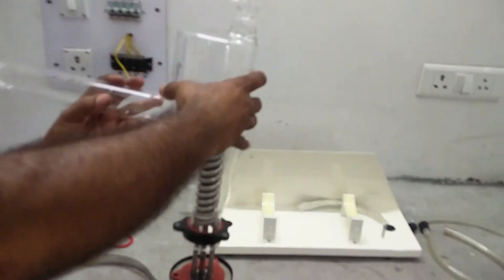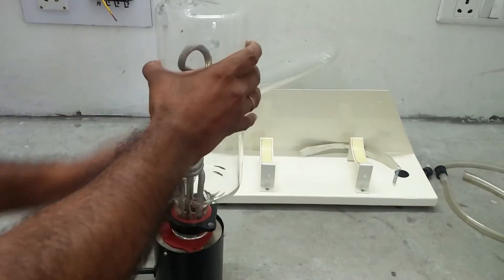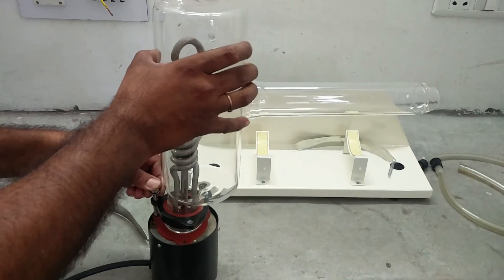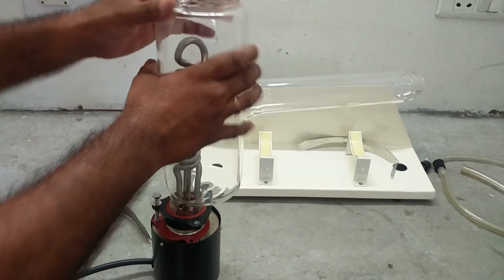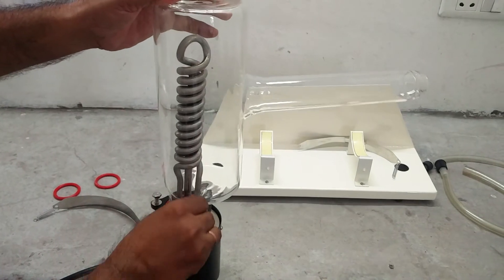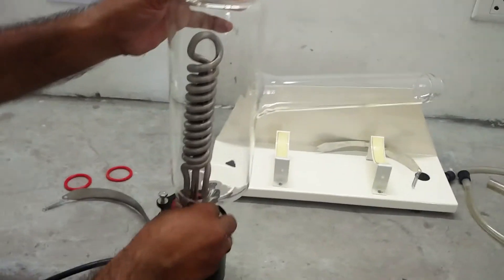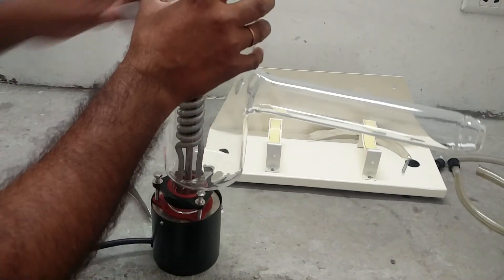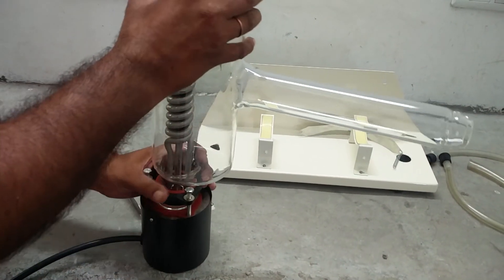Now keep the clamp like this and put it on the heater. There are three screws provided. Now tighten the heaters like this. All the three bolts have to be put simultaneously — we cannot tighten one bolt exactly.